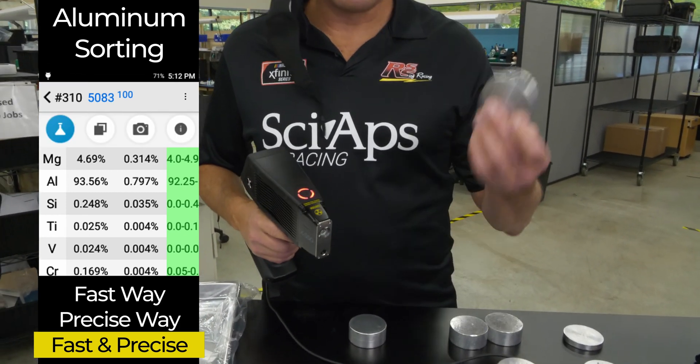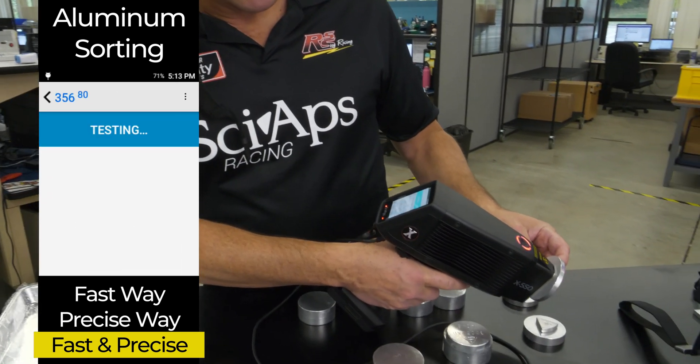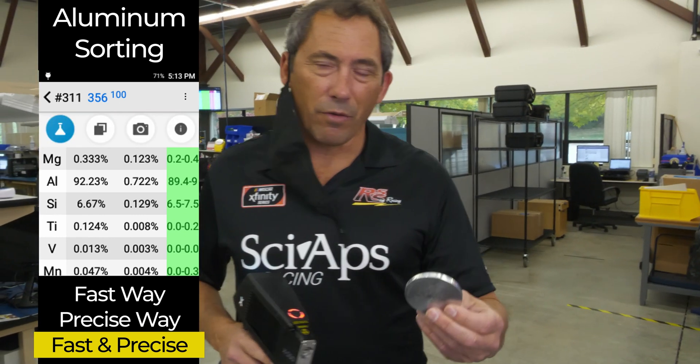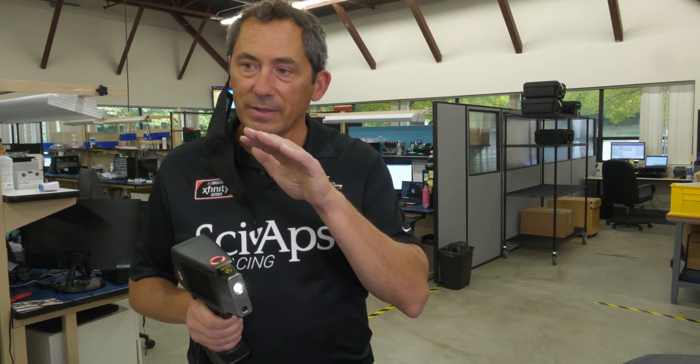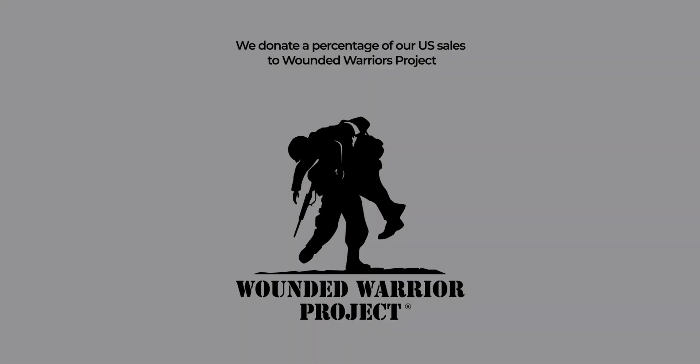And one of my favorites — this is a really hard thing to pull out with X-ray. We do it in just a couple of seconds. There's your 0.3% magnesium right there on a 356. You can sort 356 and 357 all day long in a couple of seconds with this gun, especially with the aluminum app. So that is the aluminum app — the third in the sequence of ways to sort aluminum alloys. It is set up to be optimized for fast aluminum sorting, especially fast analysis of magnesium and silicon, so you can do very precise aluminum alloy sorting very quickly. Thank you for listening to our video.